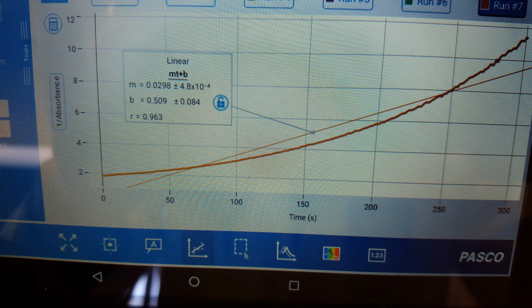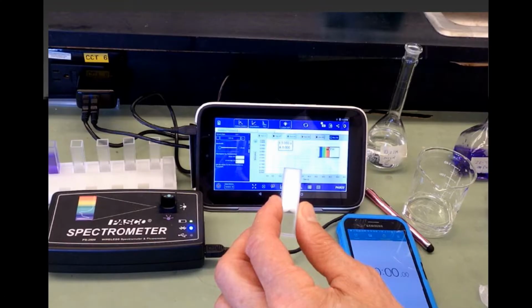So that's really all there is to Part B. Make sure you take snapshots or photographs of each of these images for your lab report. Now Part C is done very much like Part B. You'll be combining fixed ratios of crystal violet and sodium hydroxide. You'll be working in the time mode and recording absorbance versus time, but you'll be doing replicate runs with different ratios of crystal violet to sodium hydroxide.